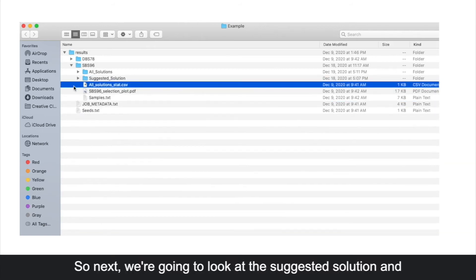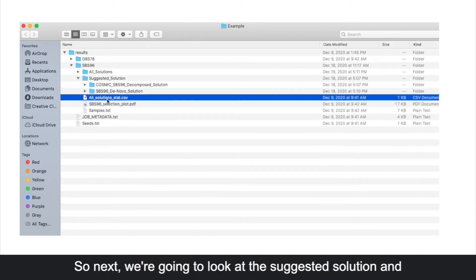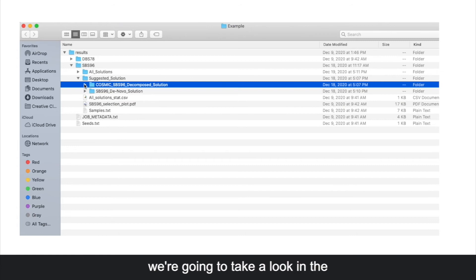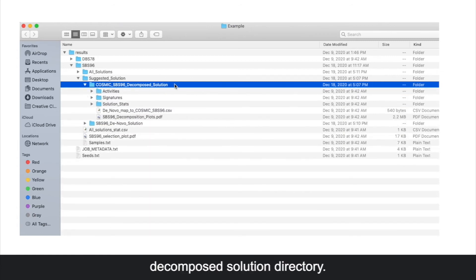Next we're going to look at the suggested solution, and we're going to take a look in the decompose solution directory.